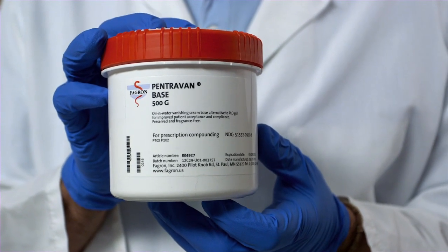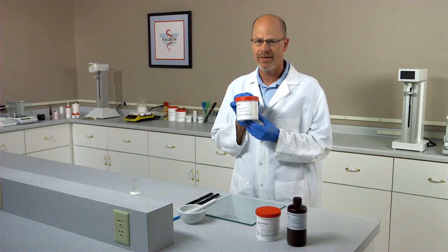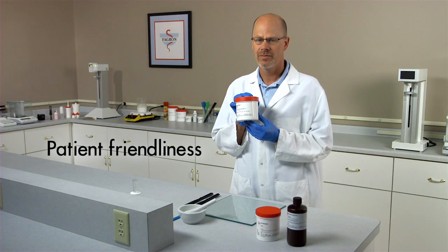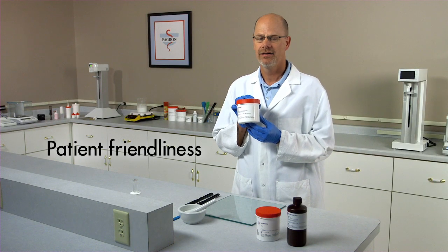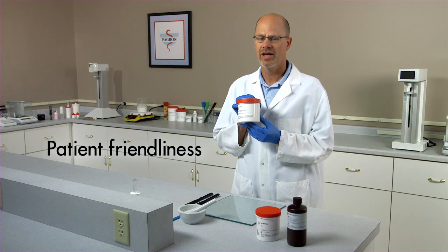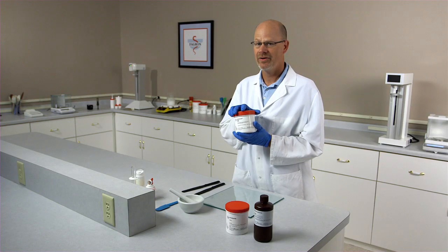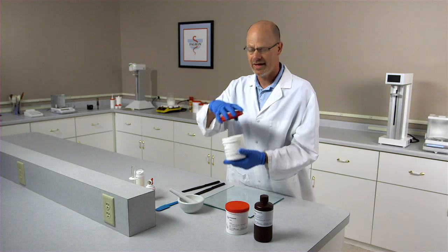Some of the advantages of compounding with Fagron's Pentravan base are: you have a vanishing cream that, when applied, absorbs readily into the skin. Pentravan is non-greasy, non-sticky, and odorless, and you'll get better patient compliance. I will now demonstrate compounding Ketoprofen 10% in Pentravan.